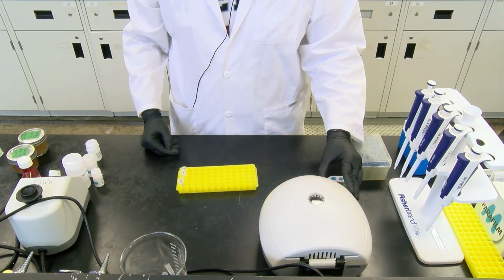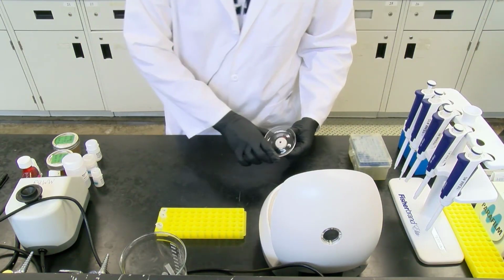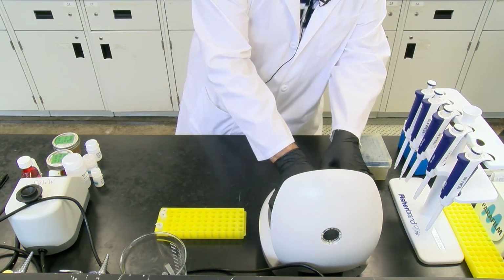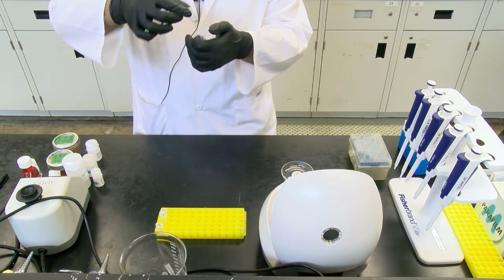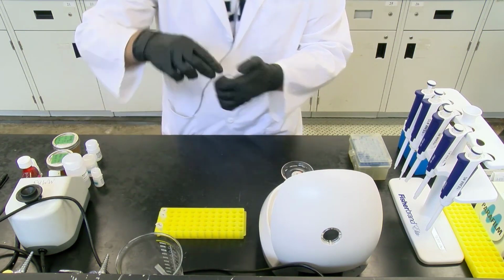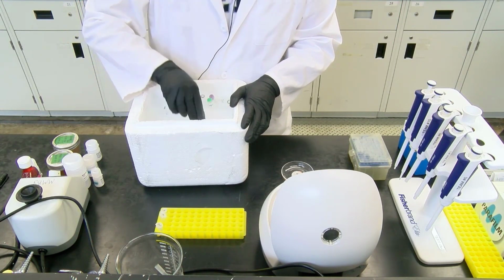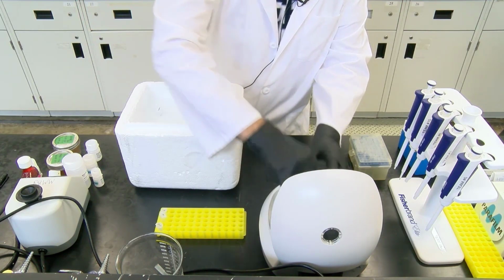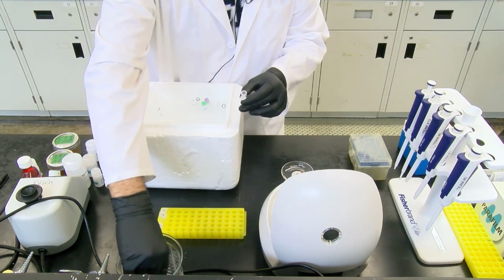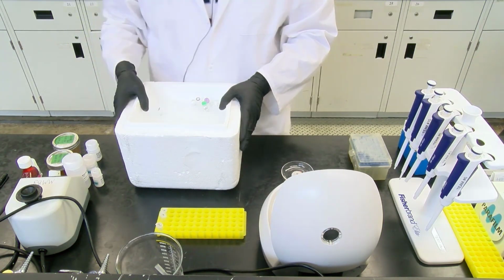And we're going to spin it for one last time for 1 minute. So now that they're finished spinning, what we should find is at the bottom of our tubes, they now contain liquid. And if you've done this right, at the bottom should be your purified DNA. So now you're going to discard your column, and you're going to store this on ice at -20. You can do the same thing with the other sample. You can discard your column now. And this should be your purified DNA, which you can use for further analysis or further studies.